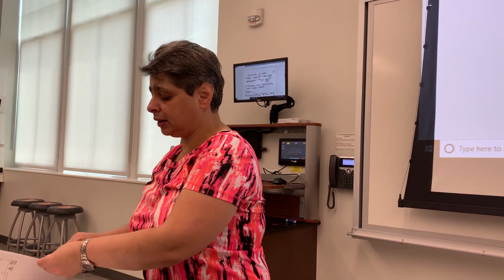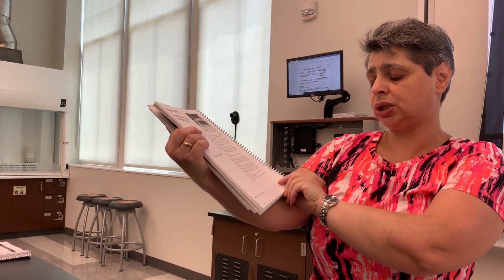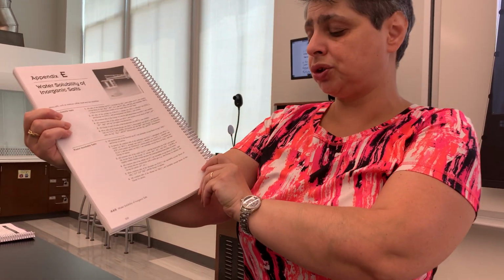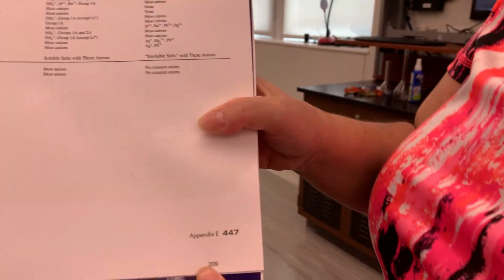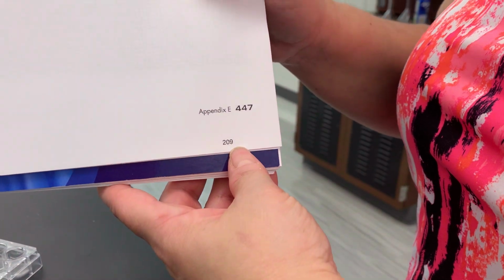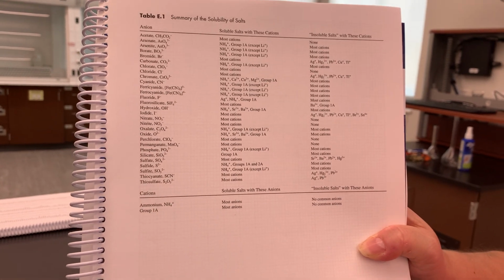And finally, the most important appendix for this experiment is Appendix E. It starts on page 208, but most importantly, the page you want to be consulting for this experiment is page 209. It's Table E1, summary of solubility of salts.